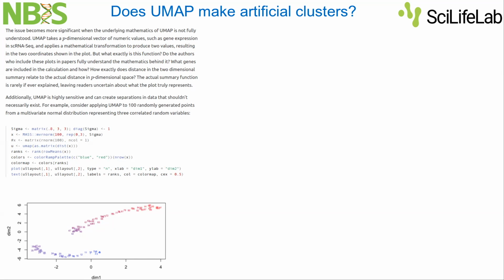When there is a lot of intra-tumor heterogeneity, like a dataset which is very diverse, would you explore both t-SNE and UMAP, or would you say t-SNE is better at identifying and maintaining these variances, so go for that kind of analysis first to identify specific groups of clusters?